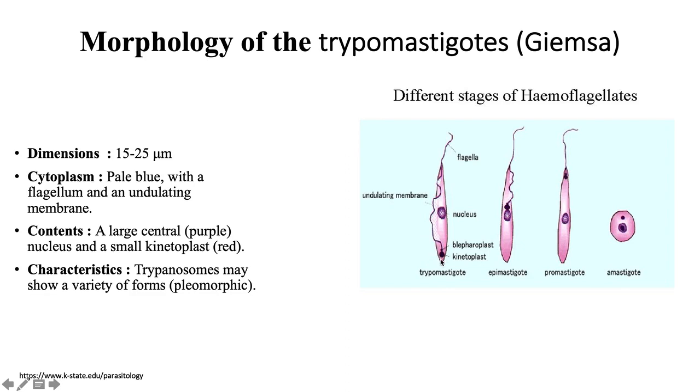Look at the flagella. It forms from here to the tail. Right. Look at the flagella.